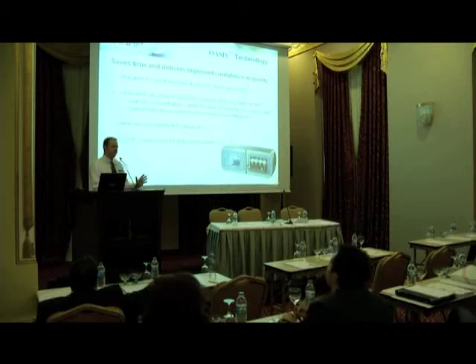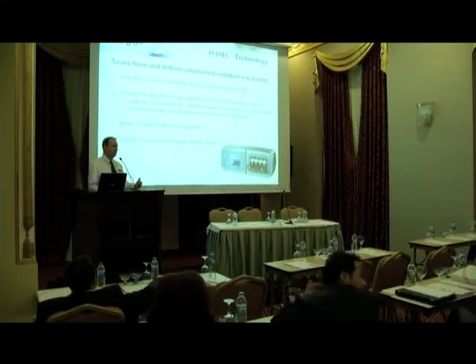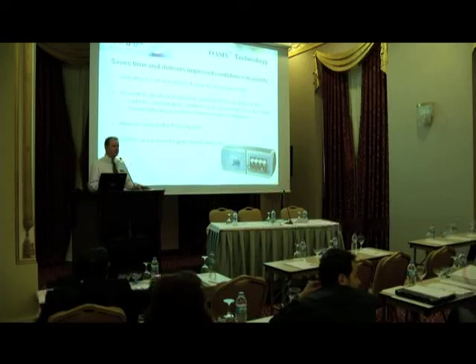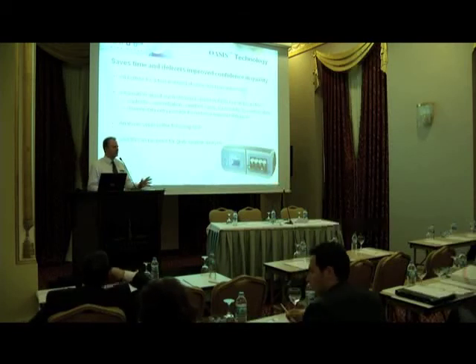As a nice side effect from this, the grab sample ports here can actually be used for water samples from the water loop. So if you were doing some investigation on your water system to see on contamination levels, you can take samples from the water loop and feed them in through here. So it's not just an online analyzer, it will do grab samples as well.